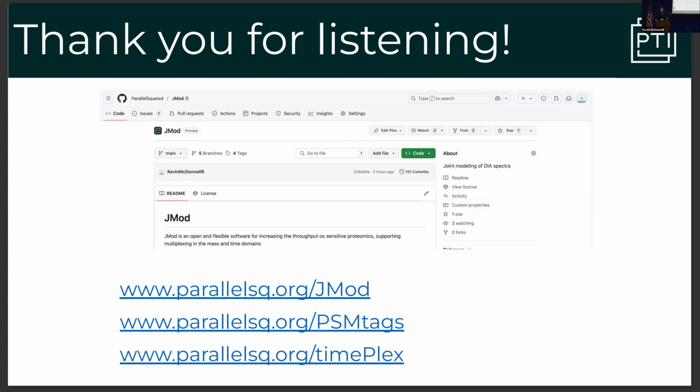And we can also reduce flow rates to minimize the impact on sensitivity. And generally, our modeling approach is very much focused on dealing with the increased density of data points, modeling that so that we can minimize the impact on quantitative accuracy. And thanks to our friends who develop more sensitive, higher resolving instruments with higher capacity, we see a lot of space to keep pushing in that direction. Nice concept. Thank you.